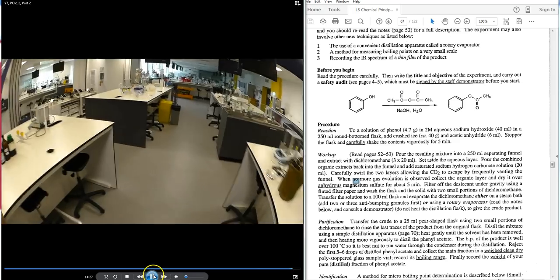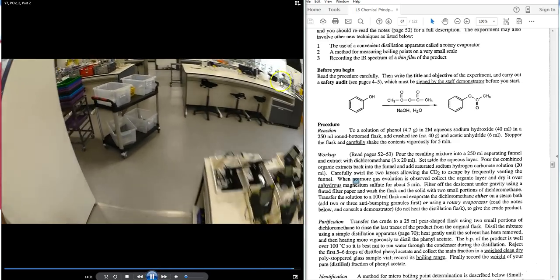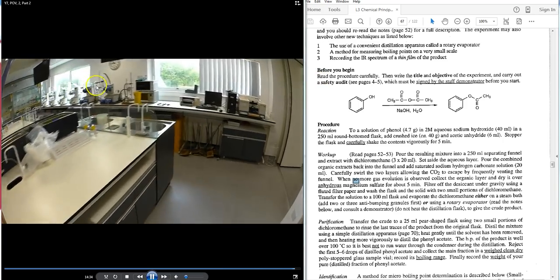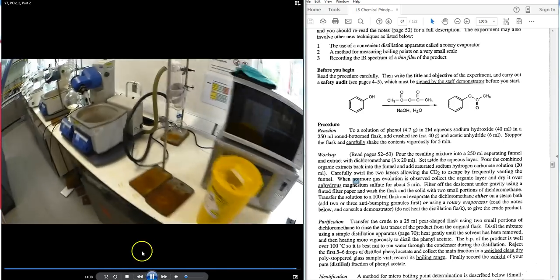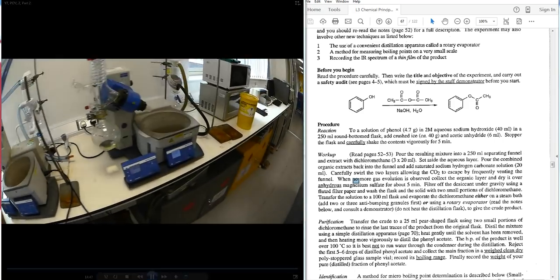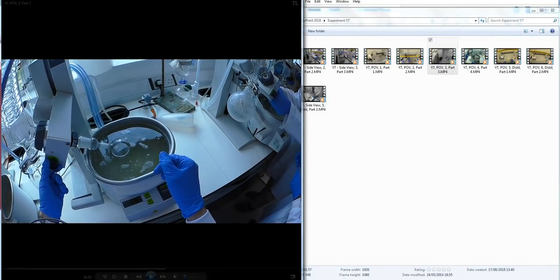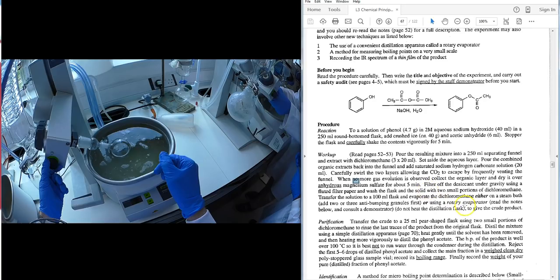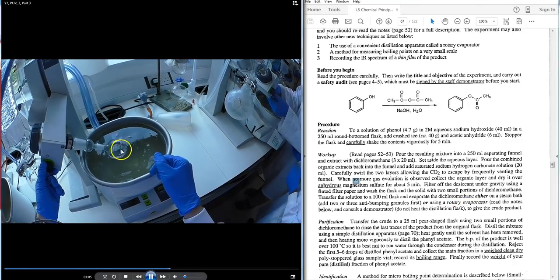The student is heading towards the rotary evaporator in teaching lab area one, near the window. The labs have the facility of a rotary evaporator rather than a steam bath. The student places the flask onto the rotary evaporator, securing it with clips.